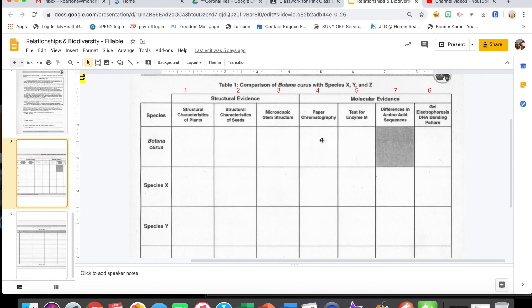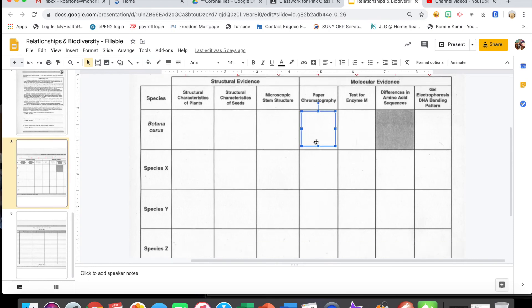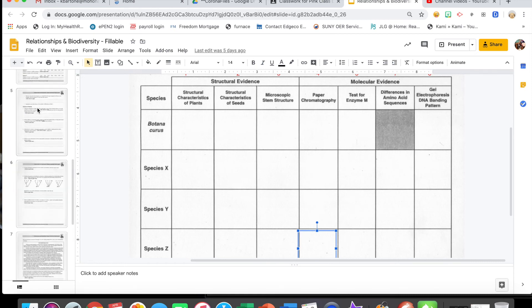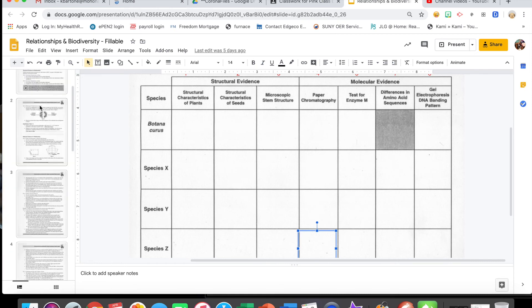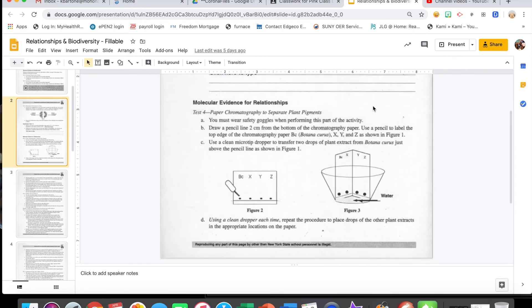Remember you're going to be writing all your data down in these columns — you should be able to click on the boxes and type right in them. For this part, on page two at the bottom, it says Test 4: Paper Chromatography to Separate Plant Pigments. For this we're supposed to wear safety goggles, so we're ready to go.